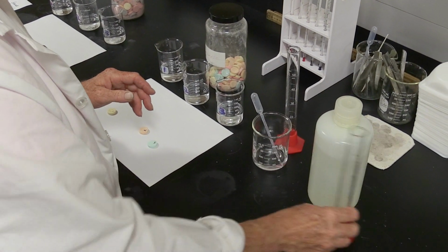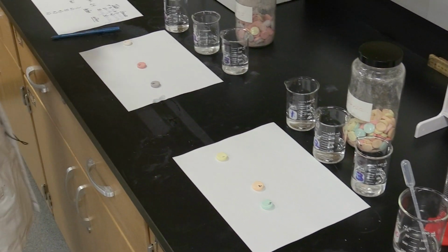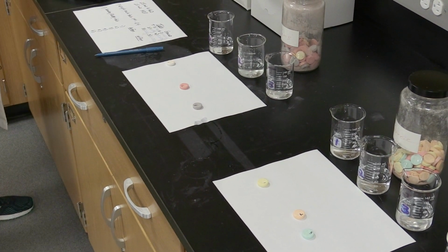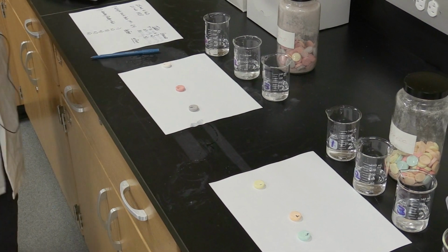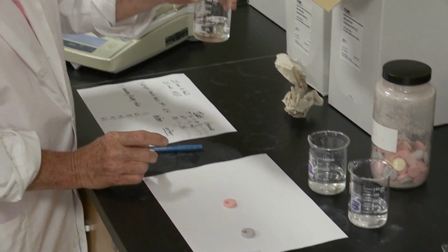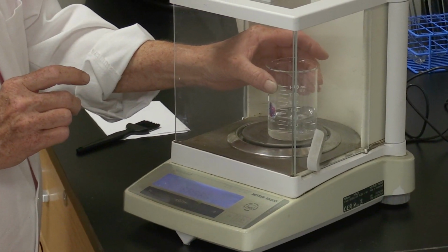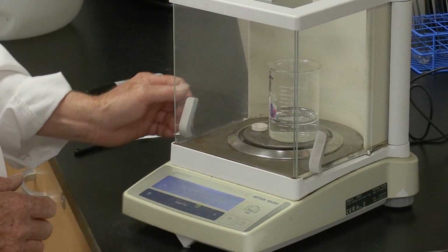Now we're going to weigh each beaker with the tablet next to it. So we'll take our beaker with our water and acid and Tums tablet number 1, the tablet next to it.